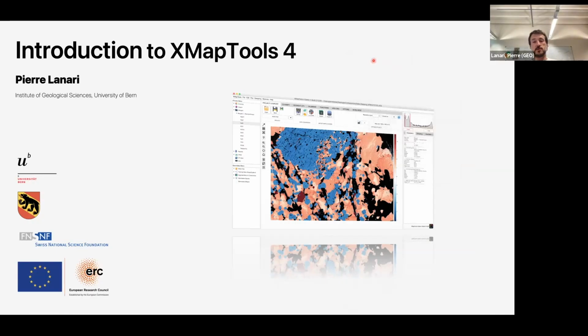Thank you very much. It's a great pleasure to show you what I have been doing with this program for the past few years now. So I want to give you a quick introduction. The idea is just to go across a few concepts that we are using and to show you a bit the evolution of the program and where we are going.